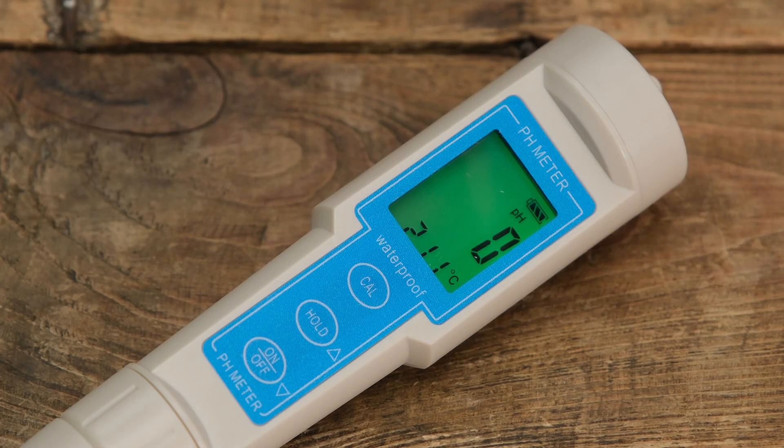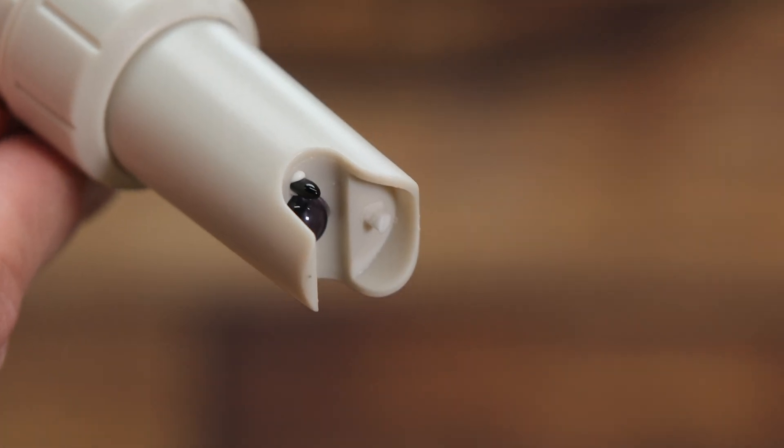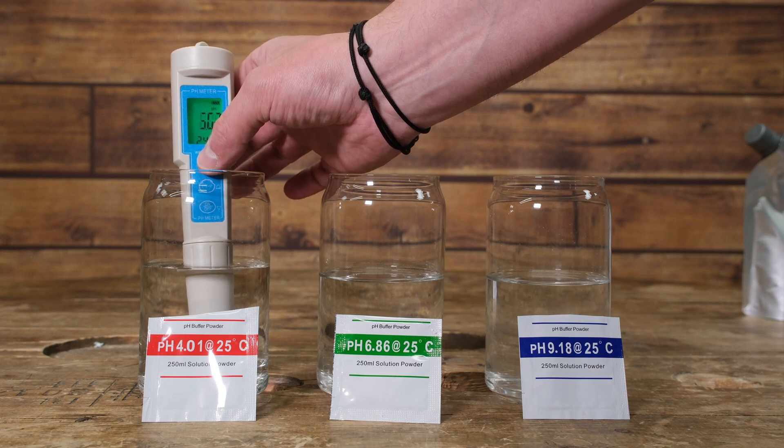Having a pH meter in your brewing arsenal is a great addition. They're relatively inexpensive, easy to use and easy to care for, but there are some things you need to note. First and foremost, keep it clean — like all brewing equipment, keep it clean after every use. Secondly, you need to learn how to calibrate it. Calibrating a pH meter might seem daunting but we're going to cover exactly how to do that in a moment. Once you've done that calibration, you can trust the readings you're getting, meaning any adjustments to your mash pH are correct and you won't accidentally overshoot or undershoot, causing problems with the finished beer.